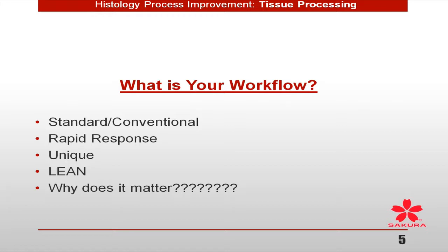Are you a rapid response? I've run into many labs now that are just doing certain types of biopsies and they need to turn those around the same day. Well, you certainly have to look at your workflow and the instrumentation that you use. Are you unique? I think most of us think that our lab is unique. Our processes are unique. Our problems are unique.